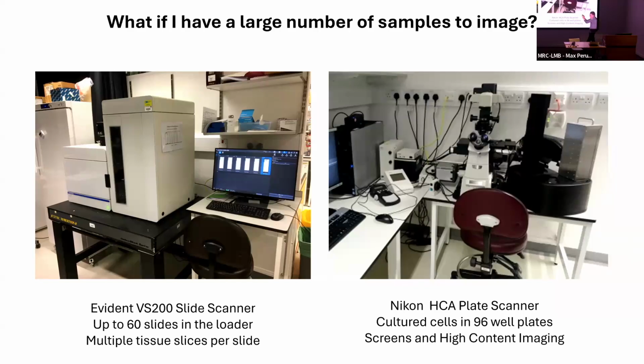And this is particularly well used in neurobiology. People are doing a lot of work with mouse models. They're getting the brains of mouse models and they're looking for rare things inside this huge tissue volume. By slicing it up and imaging on here, they can find the stuff they're interested in, take those slides and then go off to a different microscope and do higher resolution imaging.